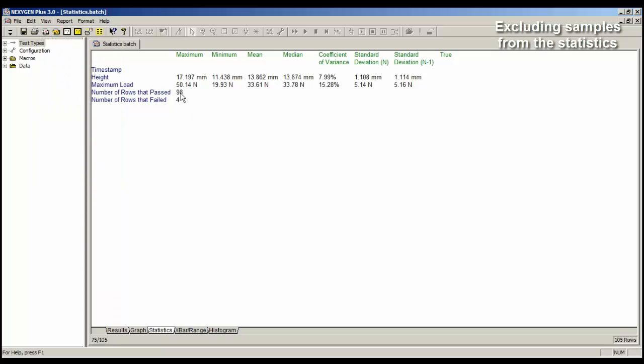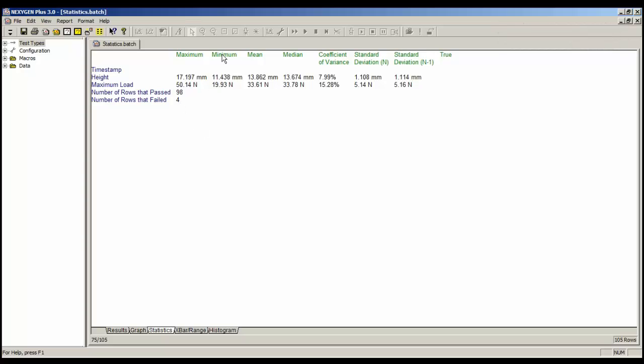It's now showing me we have 98 good tests, four failures, and of course we have the three that we excluded. And the minimum value of maximum load is now 19.93 Newtons.